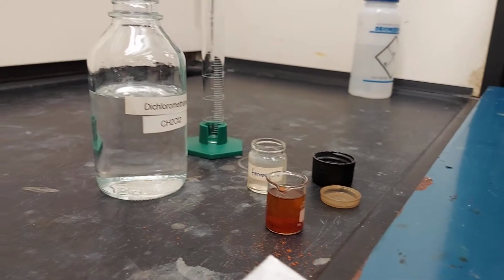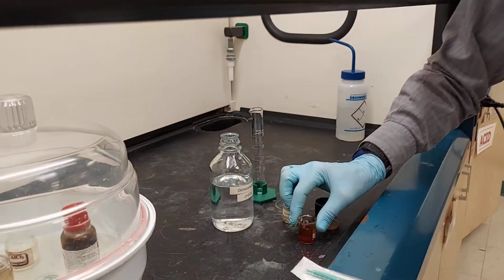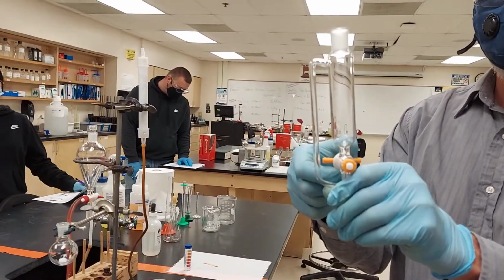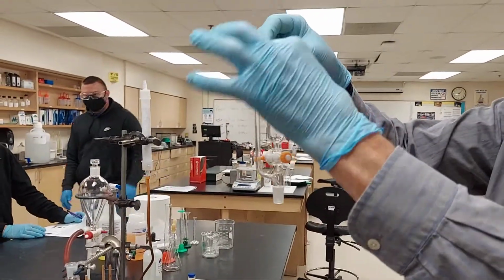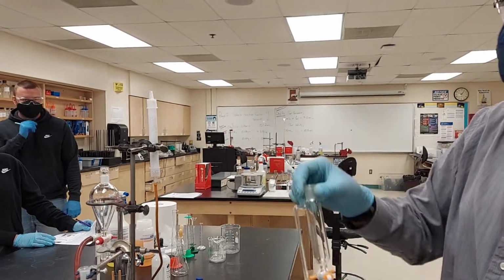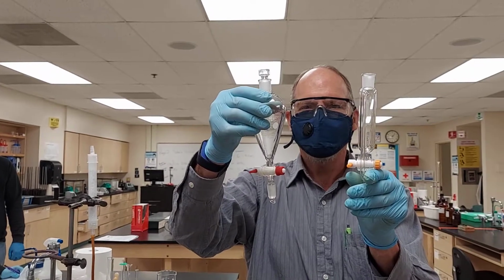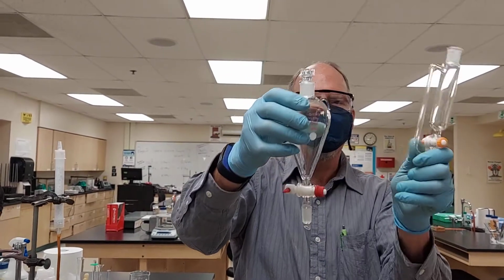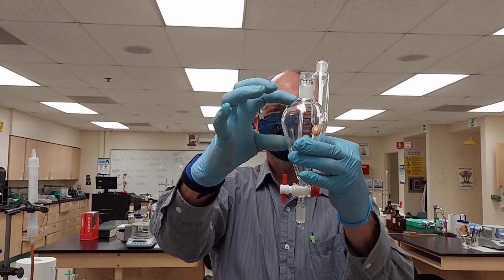And what are we going to put it in? Oh, we're in the hood. I think we're going to put it into a special device. Notice this device has a spigot and it has a side arm. Otherwise it looks pretty much like a separatory funnel. They both have a spigot and they both can be stoppered. This is not good for pouring though if it's got the stopper on, because after you pour, a vacuum happens here and it stops pouring.